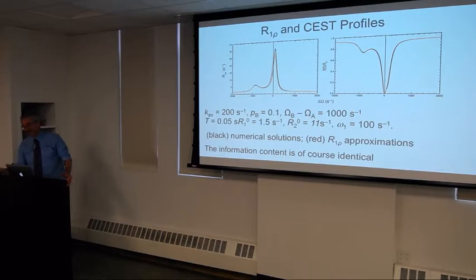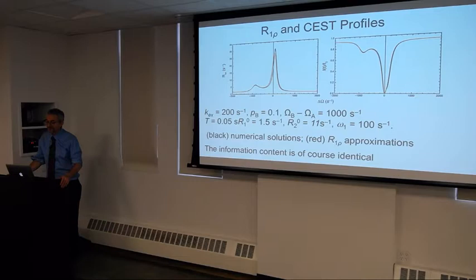The pulse sequences have gotten better, spectrometers get better. I don't think there's any magic thing, but if I look back to the CPMG experiment, after we thought it up, we had a terrible time making it work, and now it just works for everybody.